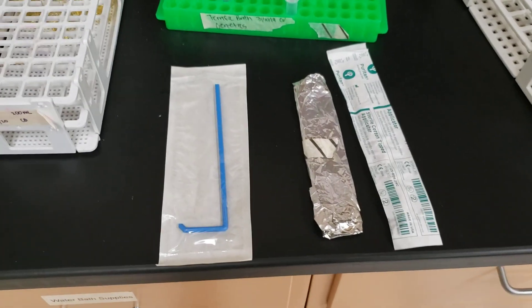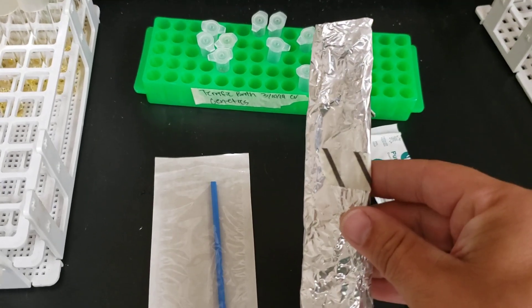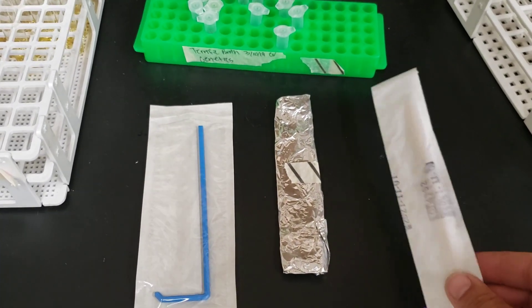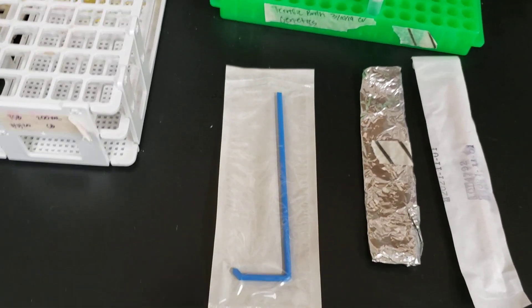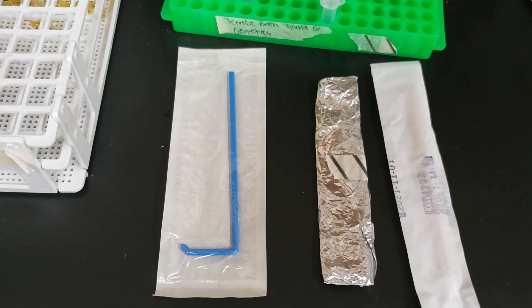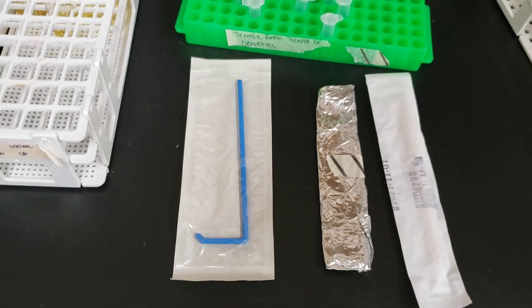For taking sterile cultures, I have wood sticks put inside tin foil and autoclaved — one or two sticks per packet. Students can pull them out; it's a very cheap and efficient method. I also got a deal on pre-sterilized wood sticks. Additionally, I found that buying plastic disposable hockey sticks for spreading colonies works better than glass. We used glass for years but had contamination issues; switching to the plastic disposable ones gave us much better results.